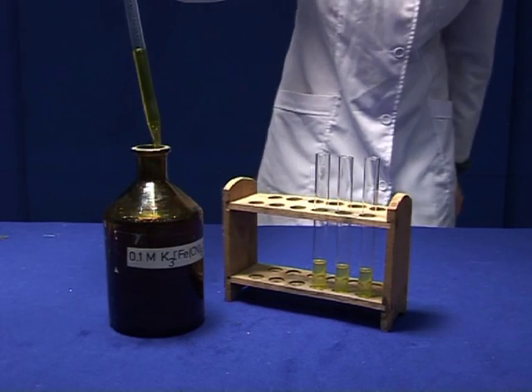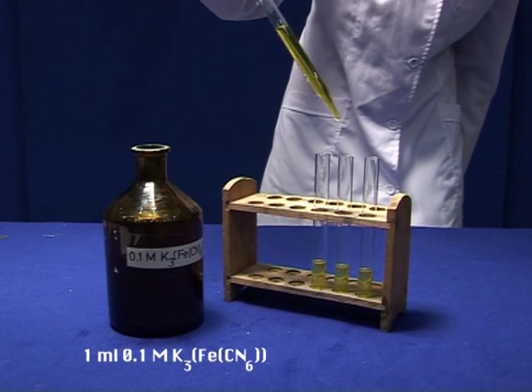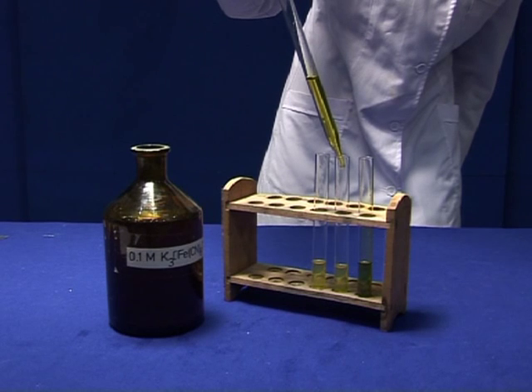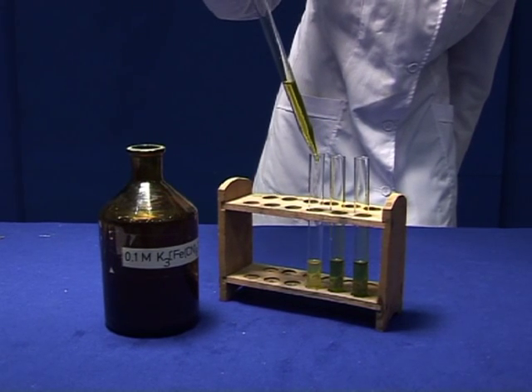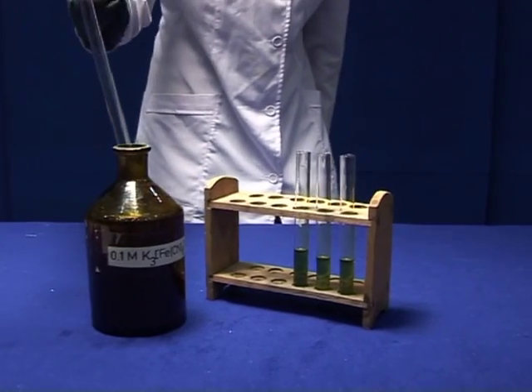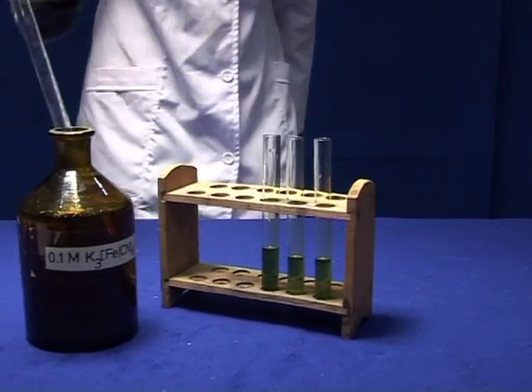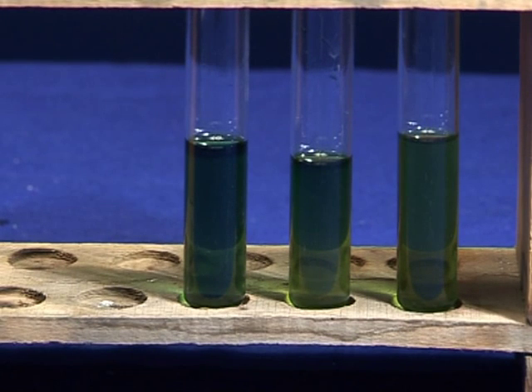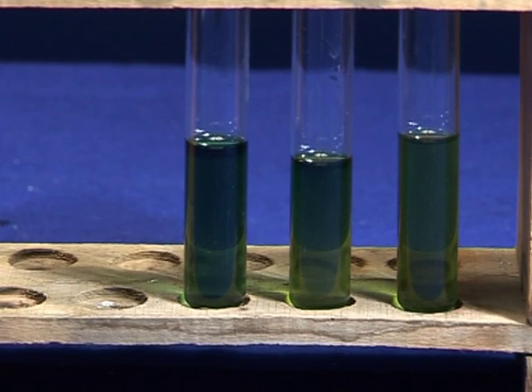To all 3 tubes, add 1 milliliter of water and 10 milliliters of 0.1 molar potassium ferric cyanide solution and mix with a stirring rod. Record your observations.